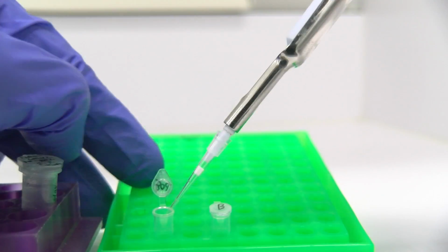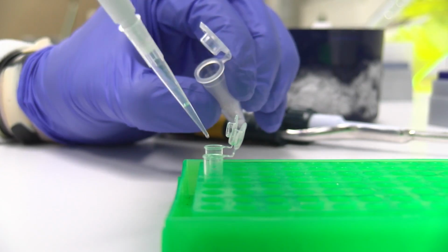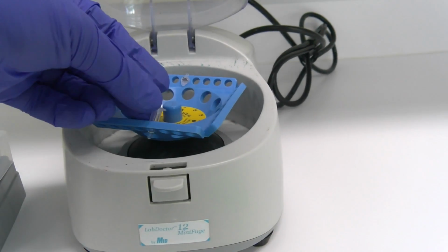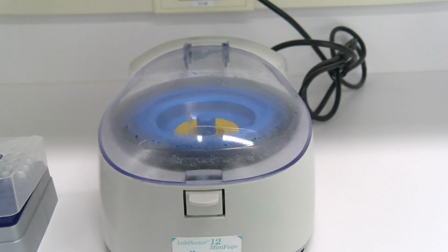After making this delineation, add each of the DNA samples and their respective primers into each individual PCR tube. Finally, add the Taq enzyme to the main mixture and distribute 23 microliters of the solution to each one of the reactions. This includes the blank. It's best practice to make sure that all of your PCR solution is combined. So before putting it in the thermocycler, make sure you centrifuge it.